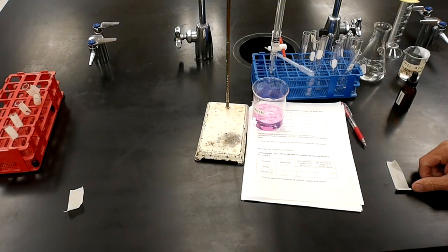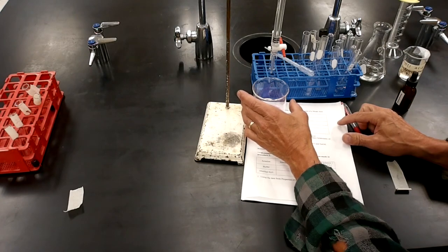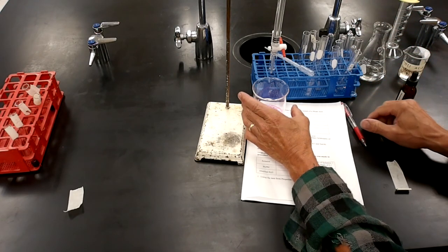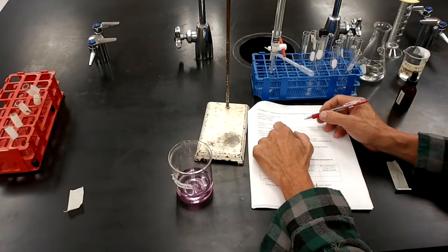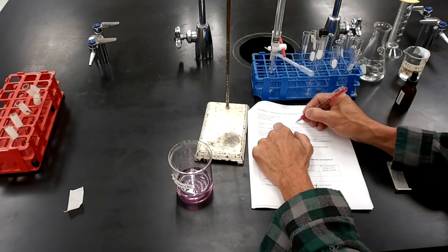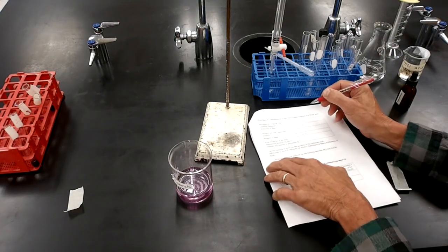That has now been neutralized. The pH is right about at 7. Now, how much of this did I drop? I am at 6 milliliters. So I added milliliters of base. I added 5.4 milliliters of base.